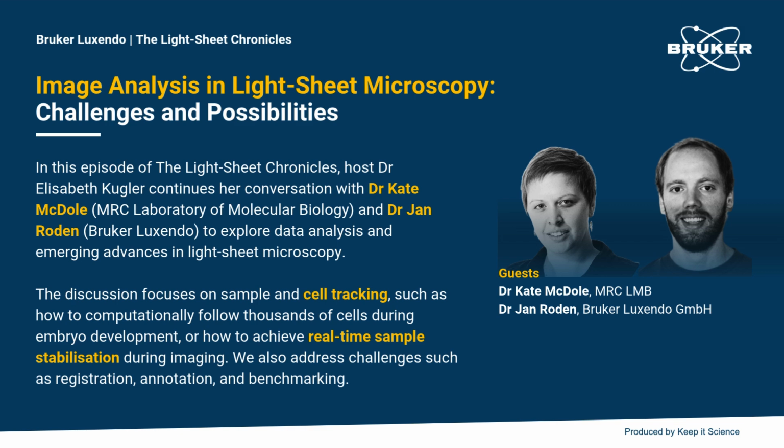And Jan, with the tracking, I think what is also interesting is, is it in XYZ, or how does it work? Yeah, exactly. So it's a 3D image registration, and it detects any sample drift or movement in any of these directions, and then can move the stage also in XYZ.